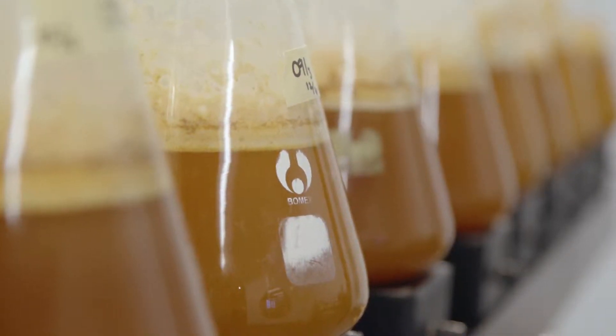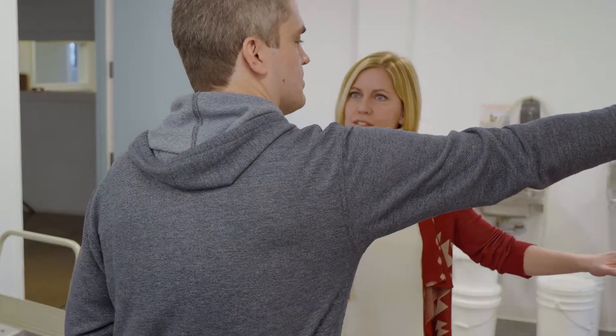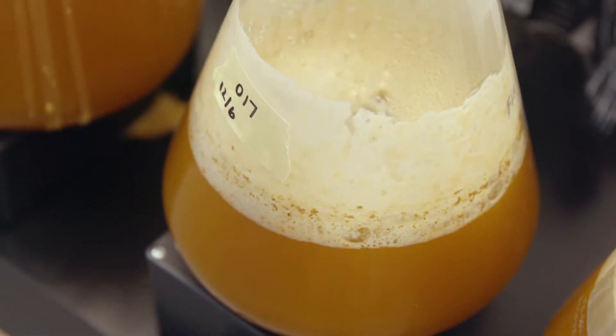So you have to explain to me what's going on. I'm assuming that this is where all the yeast is growing? Yep, this is where the process starts. The funny thing is this is basically how a home brewer would grow yeast at home at the beginning. But we start with completely sterile media and inoculate a small flask with a small amount of yeast and let it grow for 24 hours, step that up, split out into other cultures, let that grow. It's just a process of continuing to feed and the yeast continues to grow and multiply.